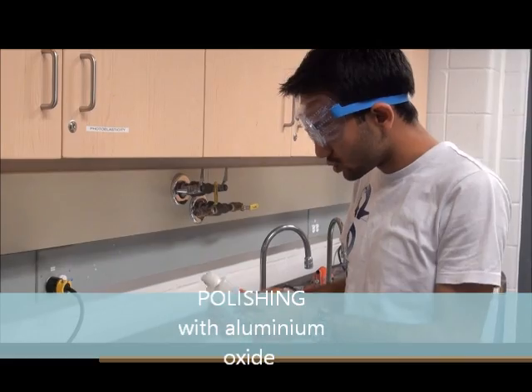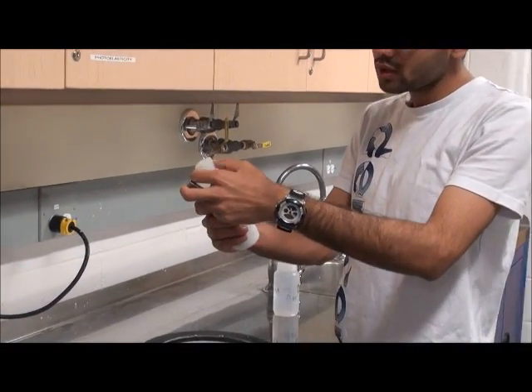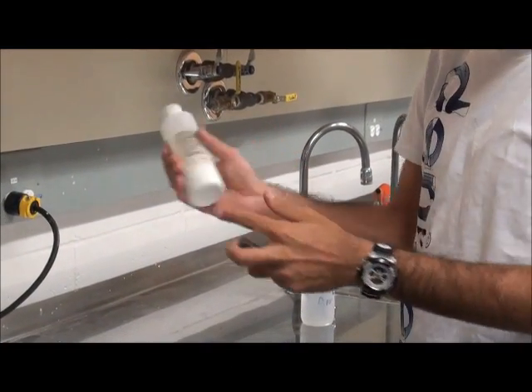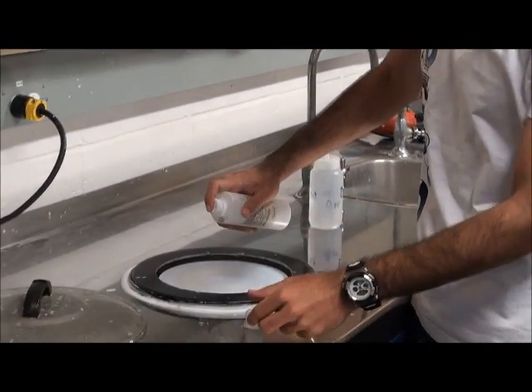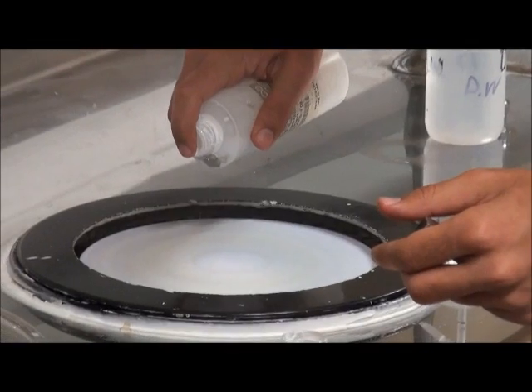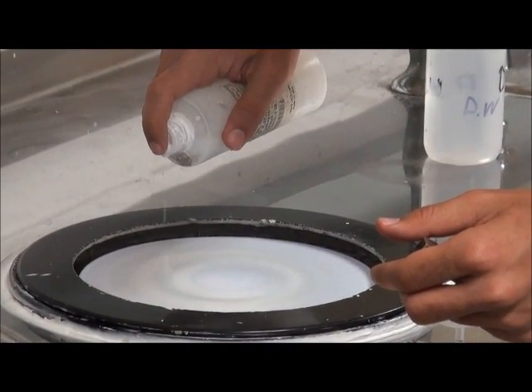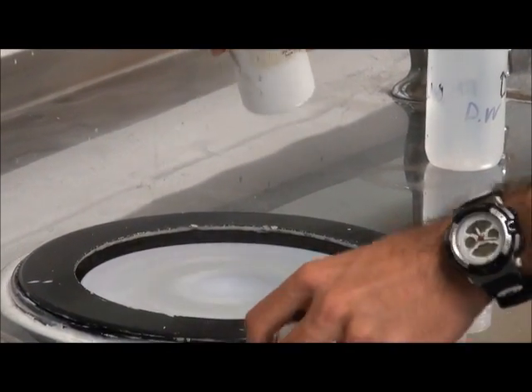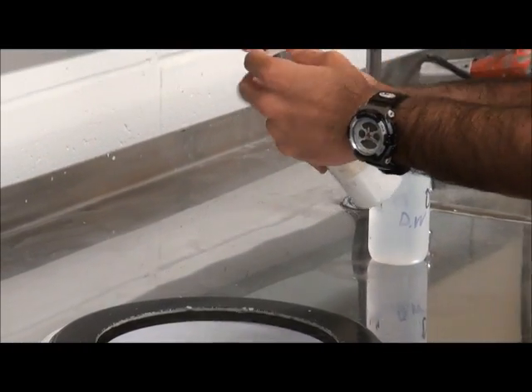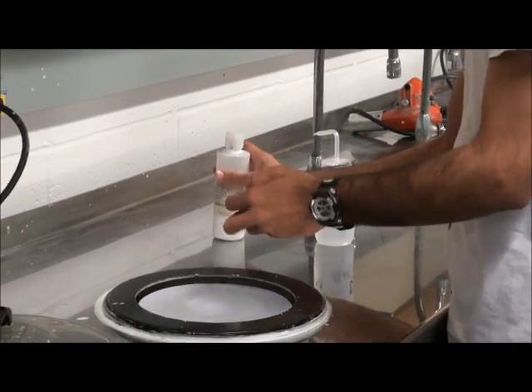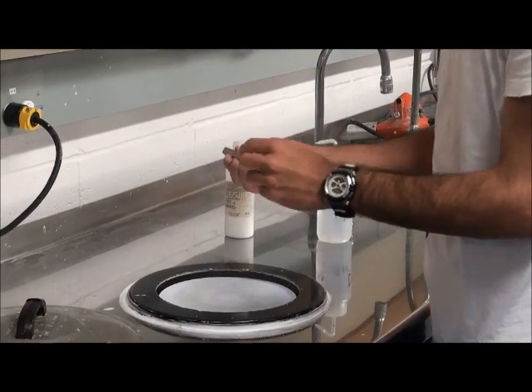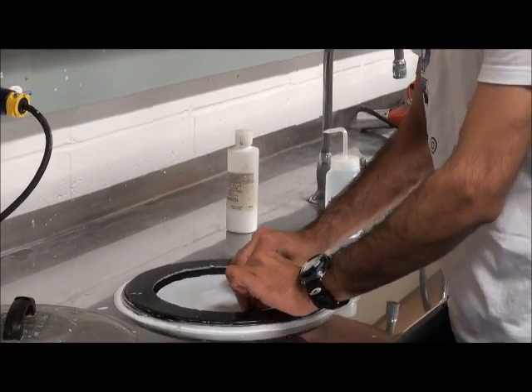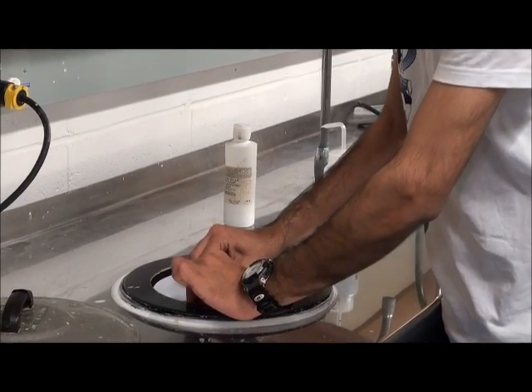First thing is to use the liquid aluminum oxide. First of all, we have to shake it properly. Then just put a small amount of aluminum on the rotor. Now just hold the sample tightly and move in the forward direction of the rotor.